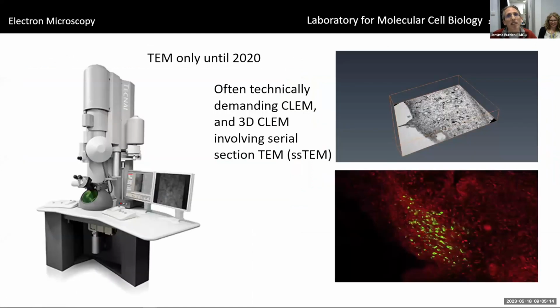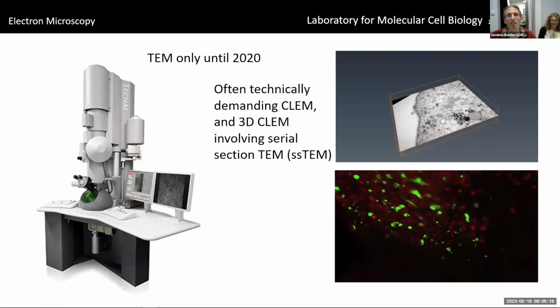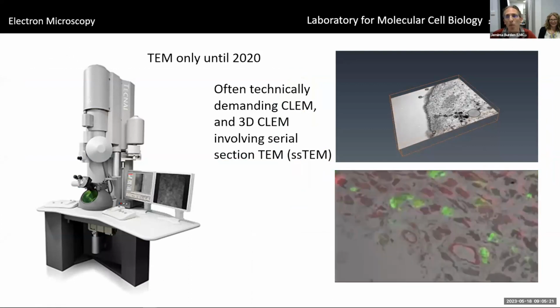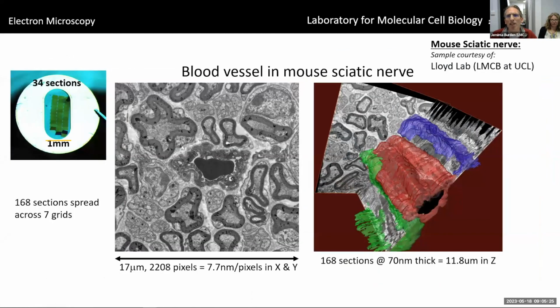And until mid-2020, we were a TEM-only lab. We often did technically demanding correlative light and electron microscopy and 3D CLEM, which by definition involves serial section TEM. The problem with that is it has its limits.